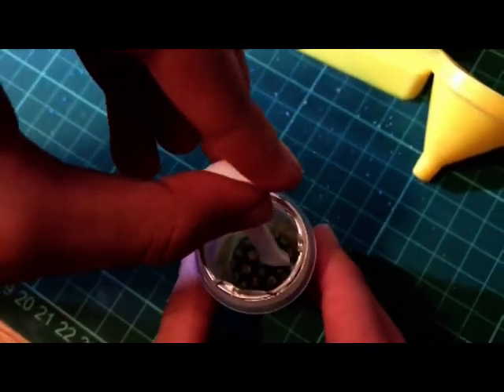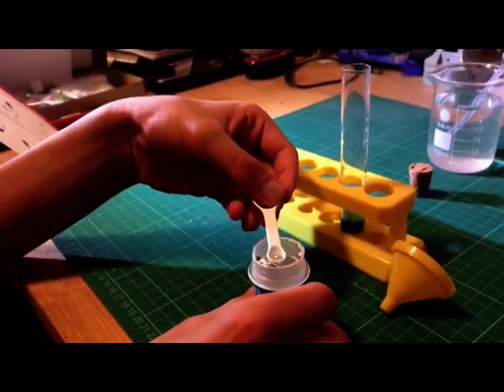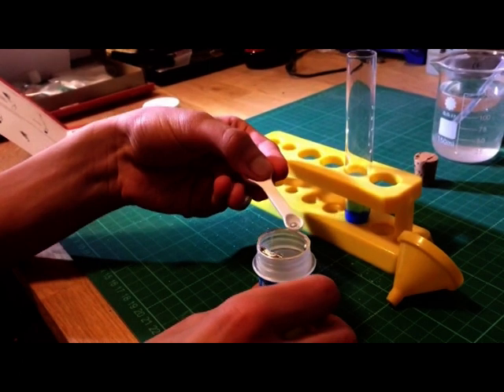After this, you add three zinc pellets inside the test tube, so that they rest on top of the layer of salt.